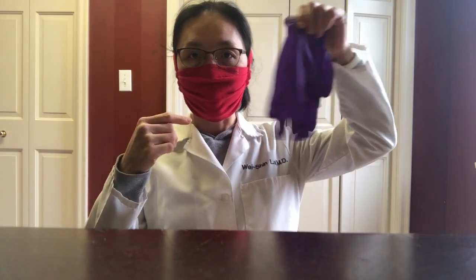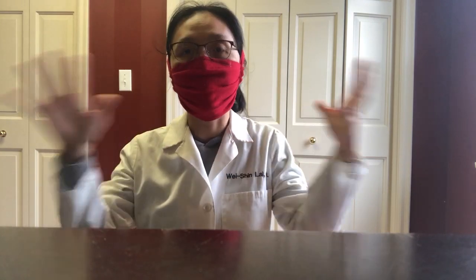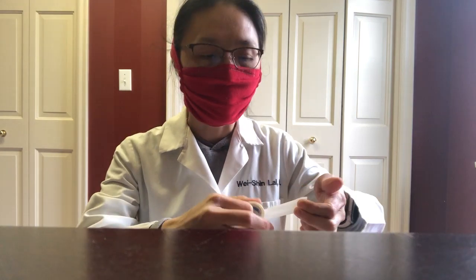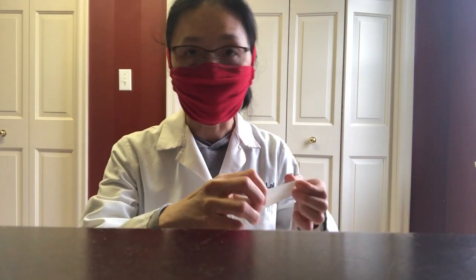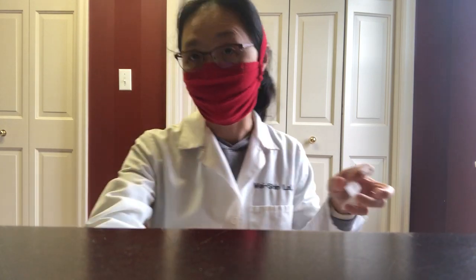I'm going to go over masks and gloves and how to wear a lab coat and how to take them all off when you're done. First of all, masks have to be comfortable. If they're not comfortable, you're going to be adjusting them all the time, and touching your face is exactly what we don't want you to do.